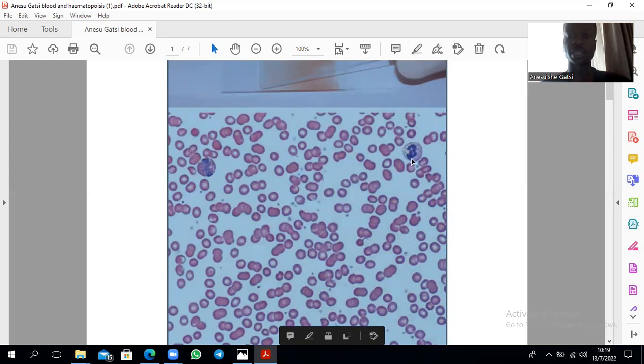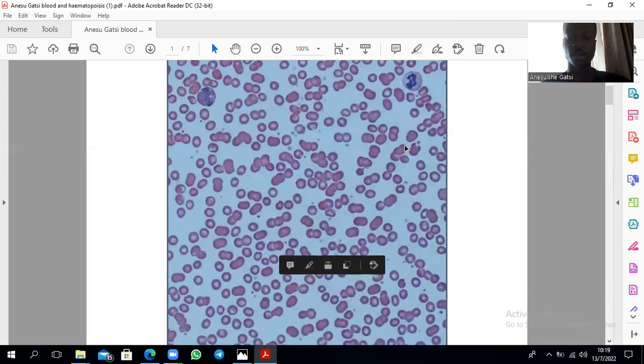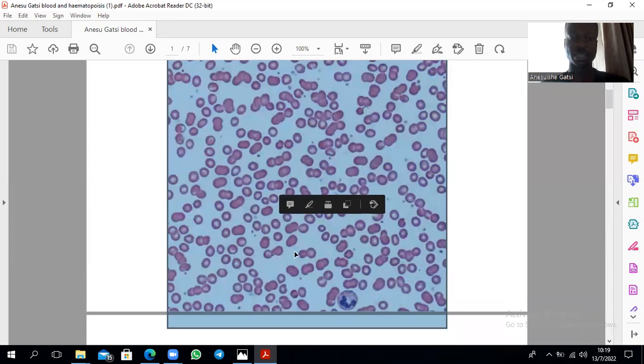Then these are leukocytes. That's a leukocyte. That's a leukocyte. To be more specific, that's an eosinophil. Then this right here, that's a neutrophil. And if you look at the bottom slides here, that's another neutrophil. Those are still red blood cells. These are thrombocytes, fragments, which are platelets. So those are your platelets, the small dots over there.